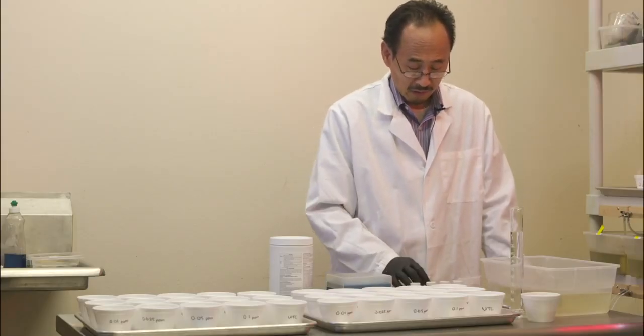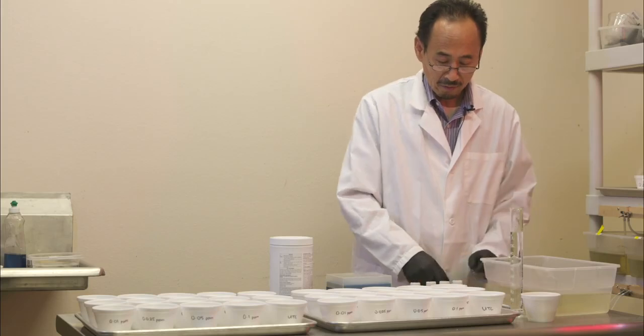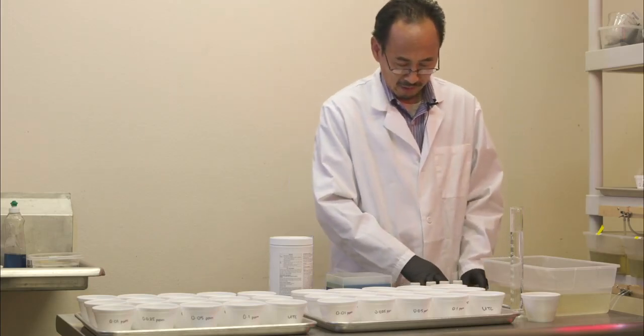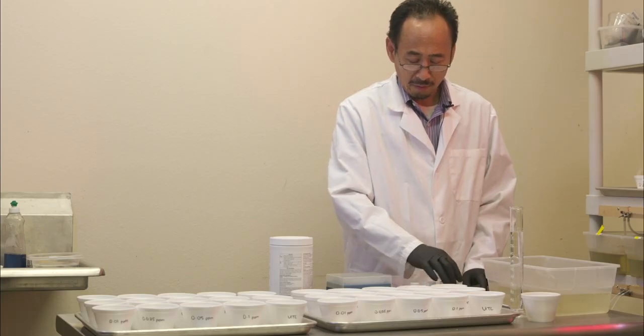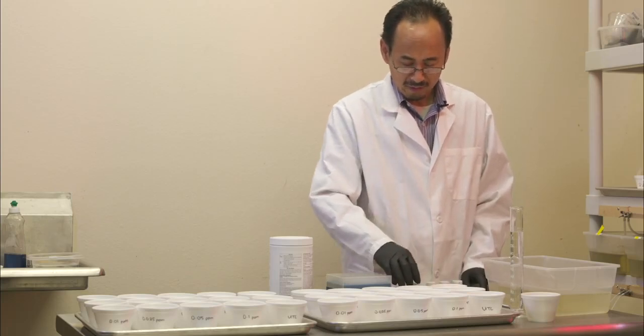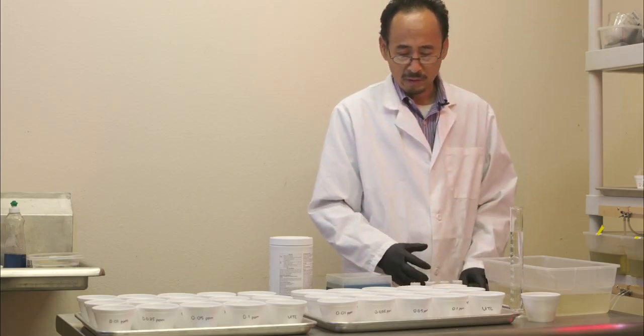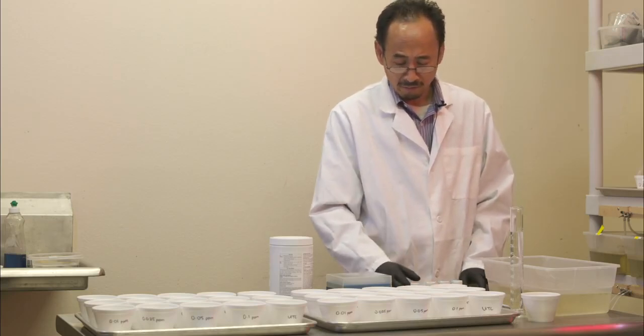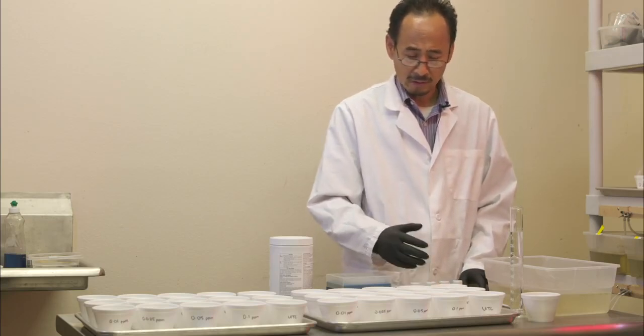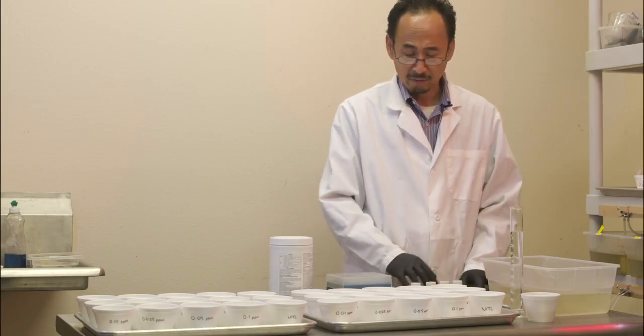Of course, every time you do this, you need to change new pipette tips to make your clean dilution. So this is the general rule for 10 times dilution, even though sometimes adjustment is needed in terms of your starting volume or ending volume, depending on your individual test, can be different, but generally most of the time you use this.